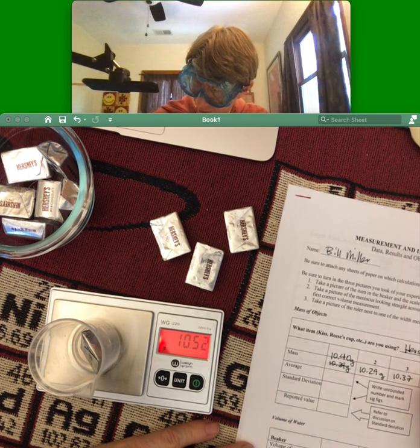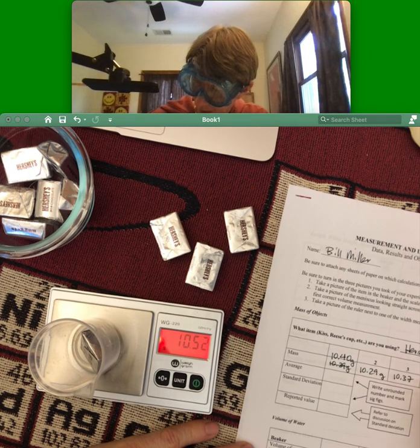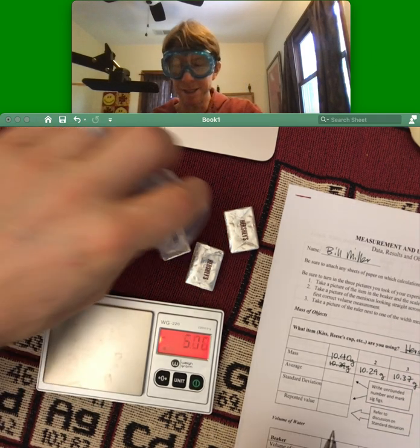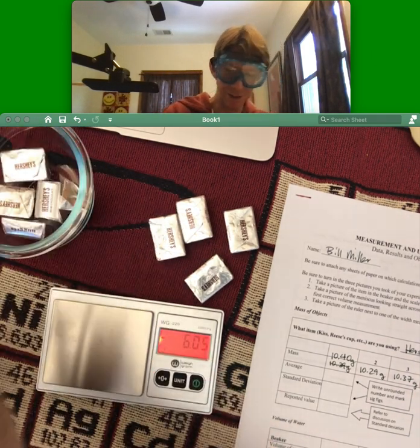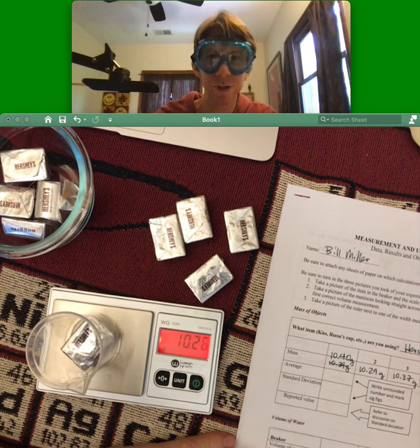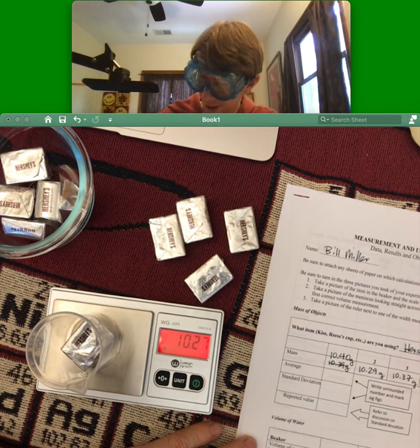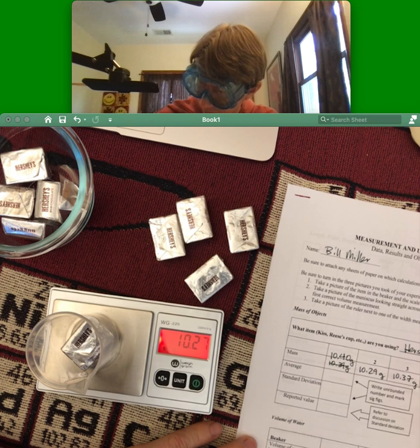All right, this one's 10.52. And you can see that in things, there are variations between every single one. And this last one's 10.27 grams.